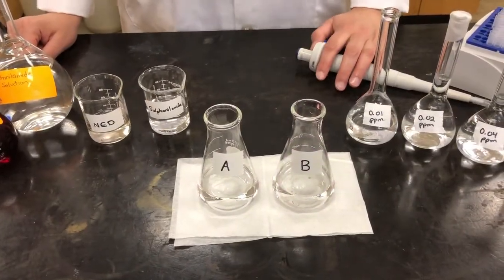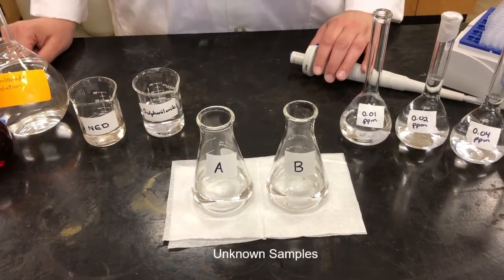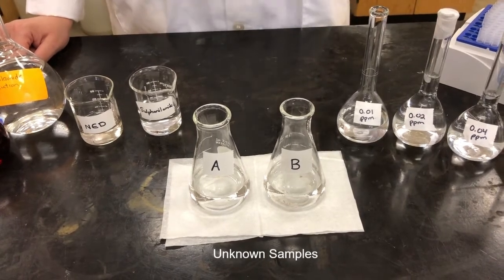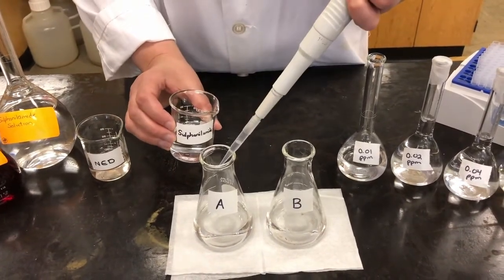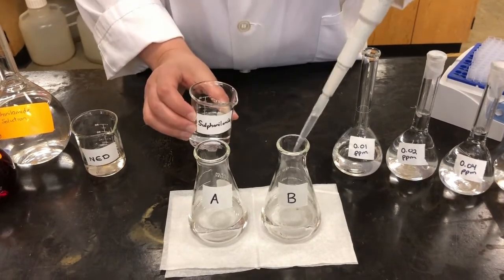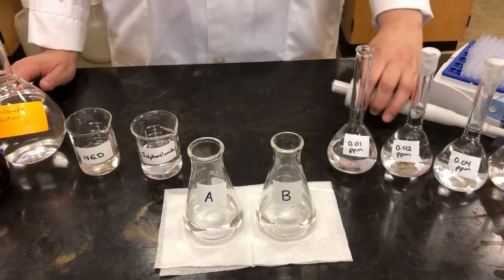Okay, so now that we have our standards all done for our calibration curve, we can move on to the samples. We have two samples here, A and B, and they both contain an unknown amount of nitrites. Same as we did before, we're going to add 1 ml of sulfanilamide to each one first. 1 ml to A, and 1 ml to B. And we're going to leave those for about 5 minutes before we add the NED reagent.